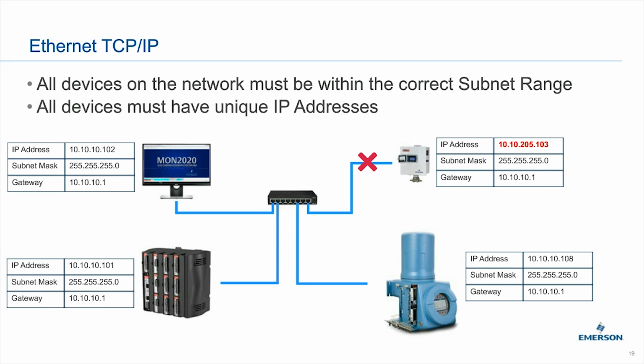Can we have wireless connectivity using Ethernet TCP/IP? Yes, certainly. We don't have wireless inside the GC itself, but you could definitely hook up the GC to a wireless hub and be able to communicate to the GC wirelessly. In fact, we do that in the factory here, where we have a wireless network and we can talk to the GCs over the wireless network.